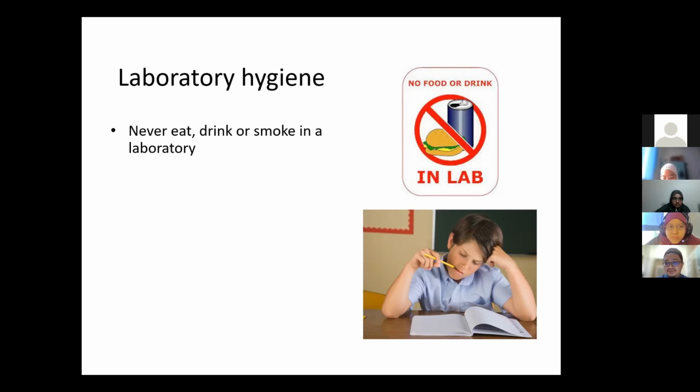Never put your water container onto the lab bench. Saya kat situ saya ni sikit, mungkin orang lain masuk pun tak boleh. But I'm lenient with regards to the plain water. Macam juga library lah. Masa kat UK dulu, library kat universiti saya, dia boleh bawa masuk air minum. Tapi mesti bertutup dalam gelas, tak boleh cup. And must be plain water, and when you drink, you put back into your bag.